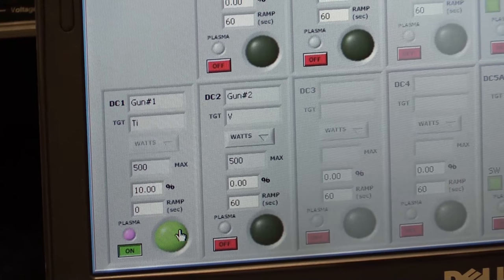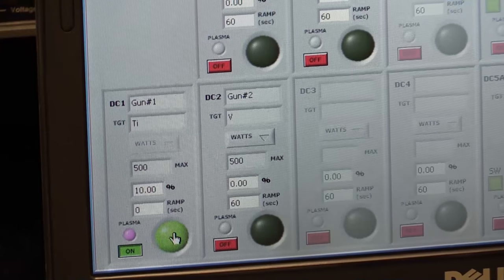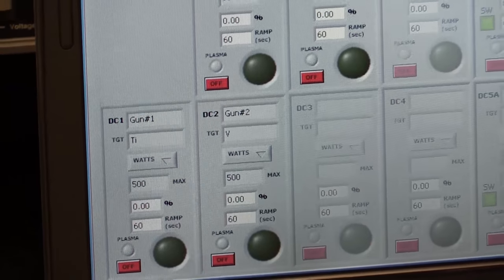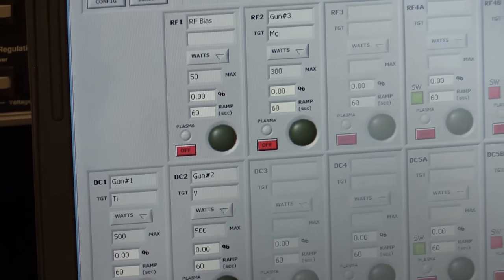I'll go ahead and say that the process is complete. I'll close the chimney, turn off the plasma, stop the argon flow, and open the VAT valve again.